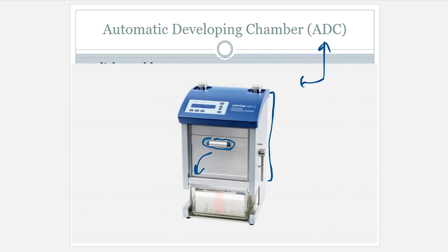Okay? Down here at the very bottom, this is where our tanks are going to be located. So there's our developing tank right there. And that is going to eventually have mobile phase or developing solvent added on the inside. So this is going to seal it off. There is a lid. It is sealed. It can't escape. That is part of the developing chamber.